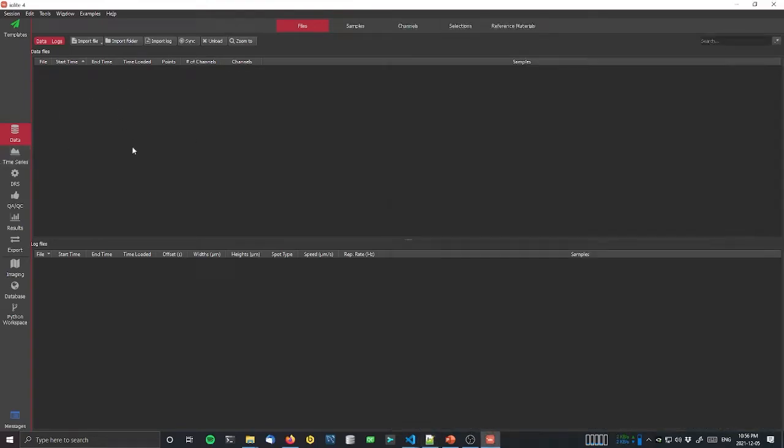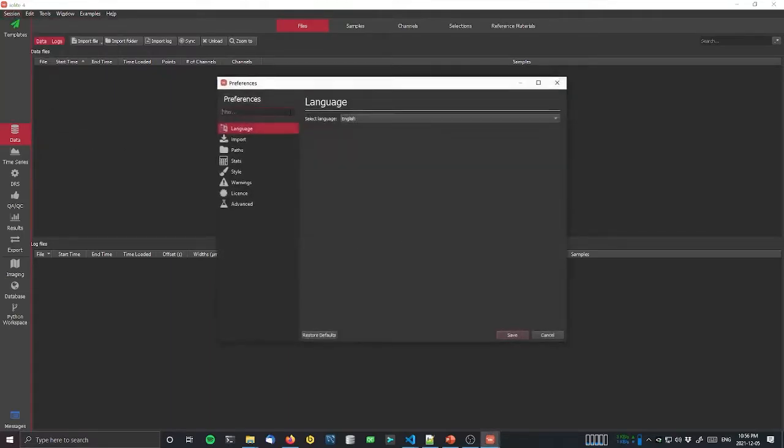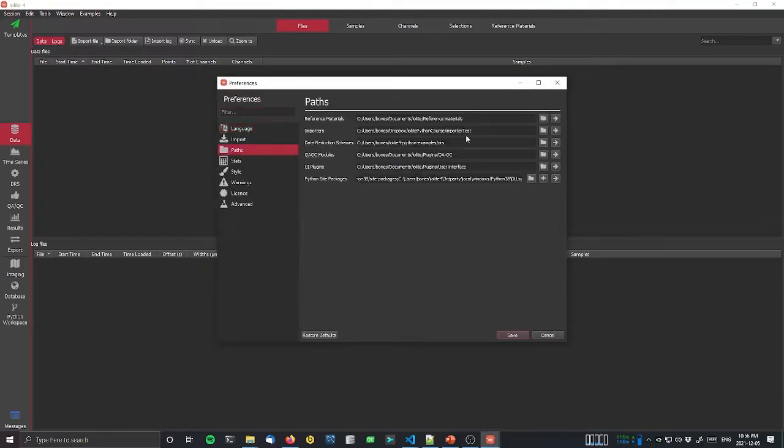The next thing I'll do is either take out any other custom importers that I have in my importer folder. So if this is the folder it's looking in, I'll make sure that there aren't any other importers there, just so that I know that they're not going to be interfering with one another and that there'll only be one custom importer being called at a time.